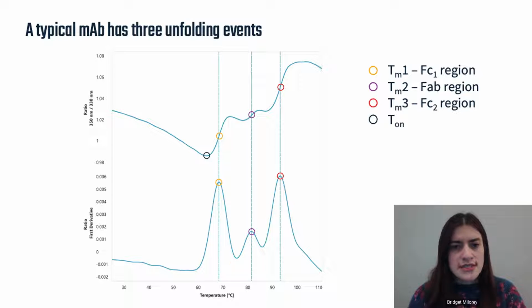Yes. So this data here, as I indicated, is the NIST MAB. It is in its histidine buffer, which is a very stable system. Not every antibody that you are looking at will be that stable. And I also want to point out that nanoDSF is really just one piece of a puzzle. If you want a full stability picture, there are combinatorial approaches that become necessary. So we have actually provided some links to other videos that take a deeper dive into that concept.